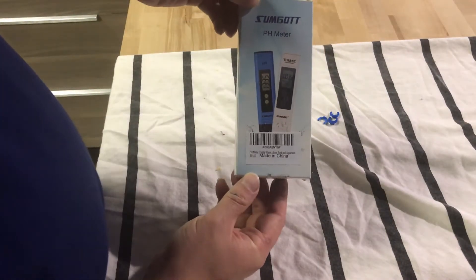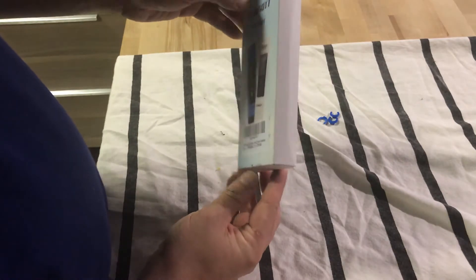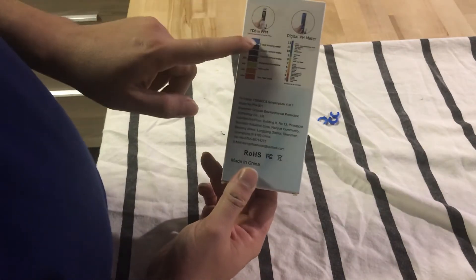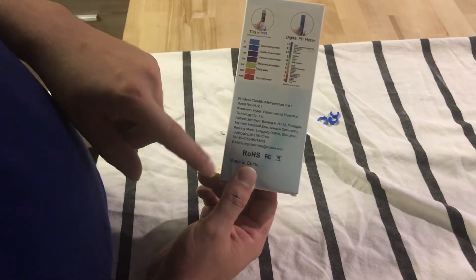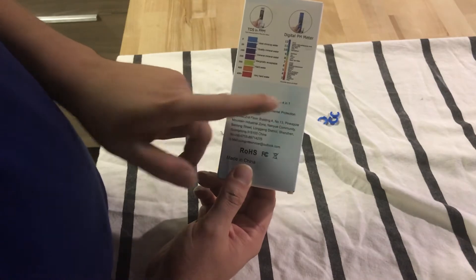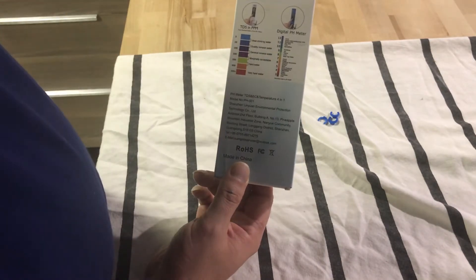This one was a 4-in-1, so that's why I bought it — it was a little bit more expensive, but it's supposed to be a 4-in-1. So it's a TDS meter, a digital pH meter, and it does temperature. The other ones were a 3-in-1, so that's why I got it.